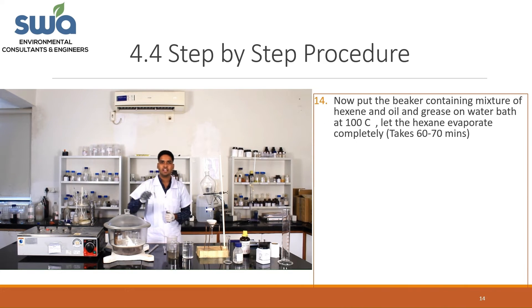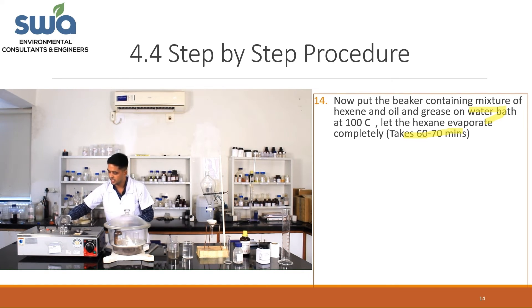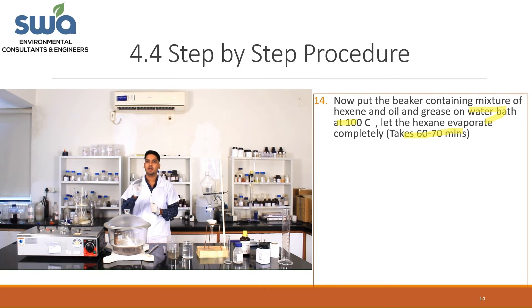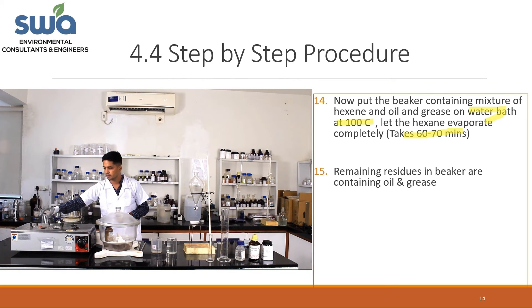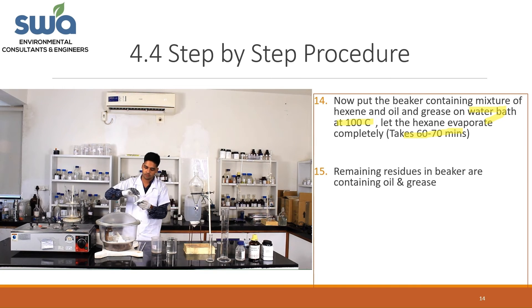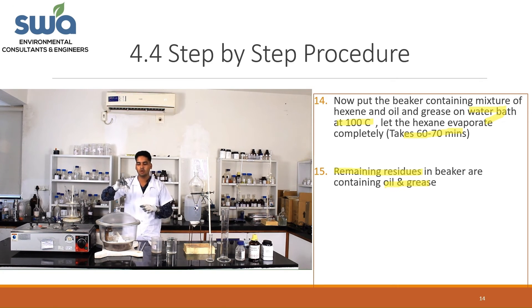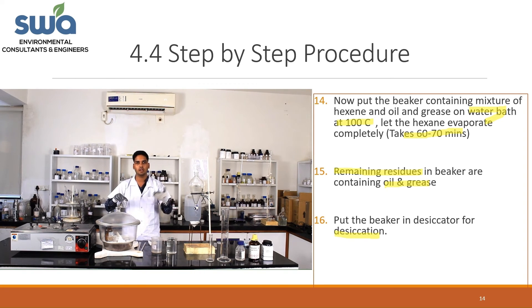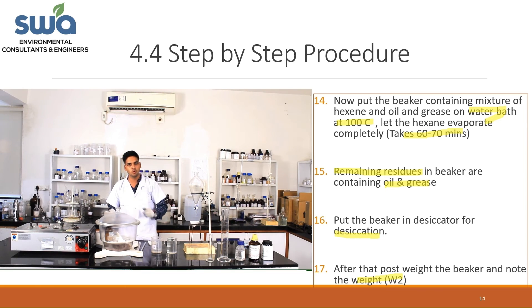After completing the extraction twice, take the beaker containing the hexane and oil-and-grease emulsion and place it on the water bath at 100°C for approximately 50 to 60 minutes to evaporate the hexane. After evaporation, remove the beaker and clean it with tissue paper. You will be able to see small droplets — these are the oil and grease residues, as the hexane has fully evaporated. Place the beaker into the desiccator with silica gel to soak any remaining moisture, then post-weigh the beaker on the analytical balance and record it as W2.